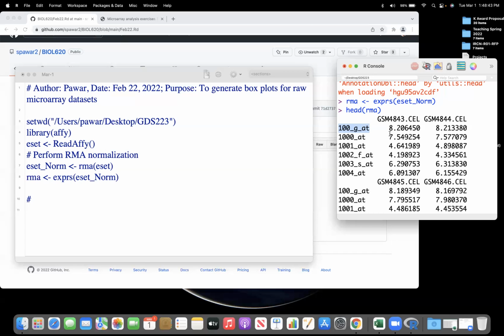So what are interesting genes? Say the interesting genes are the ones which have high fold change or low fold change. The fold change value can range from minus infinity through 0 to plus infinity, so that would be the range of the numbers in this third column.